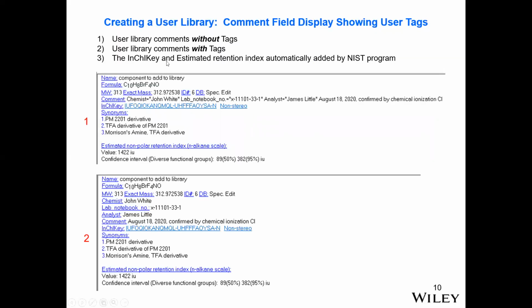The other thing I wanted to say is that the InChIKey and the estimated retention index are automatically added by the NIST program when you add it to the library. So it calculates an estimated retention index that you can use to compare to other ones in the database, and the InChIKey for exact structure searches and display.